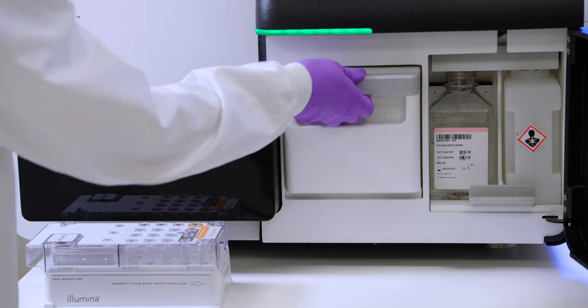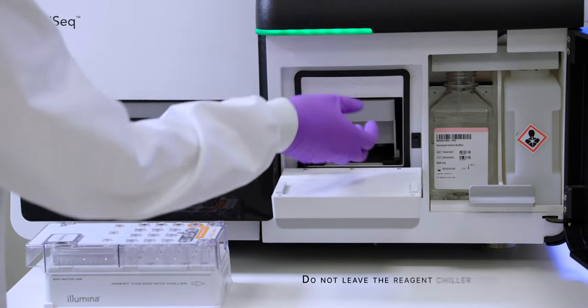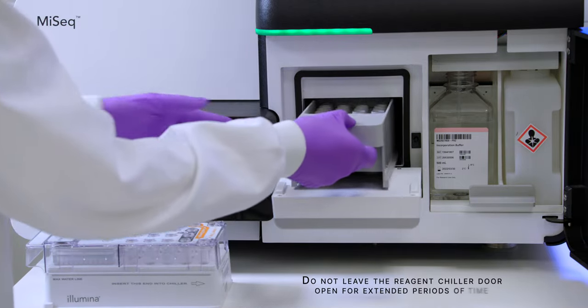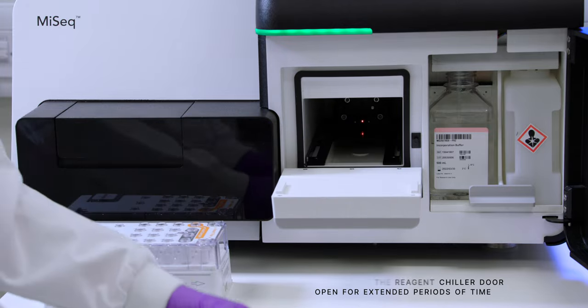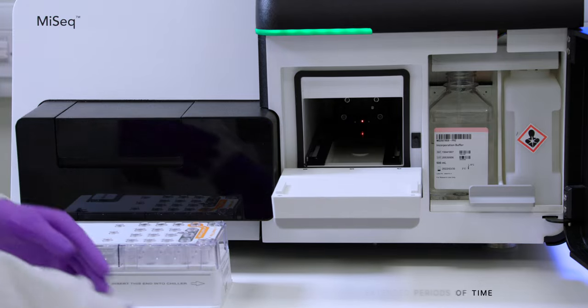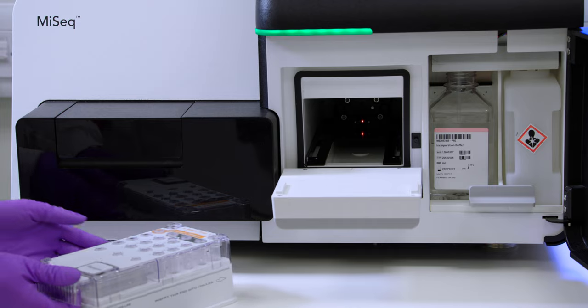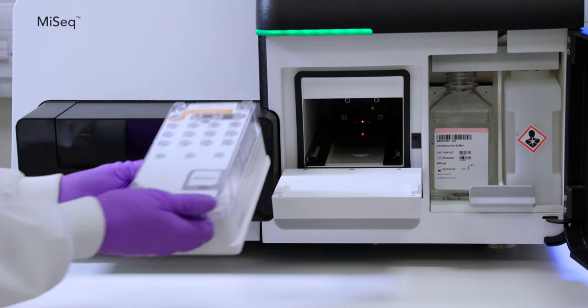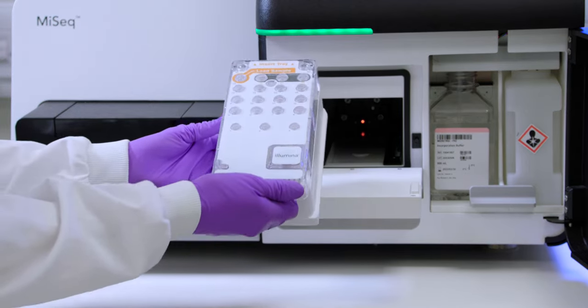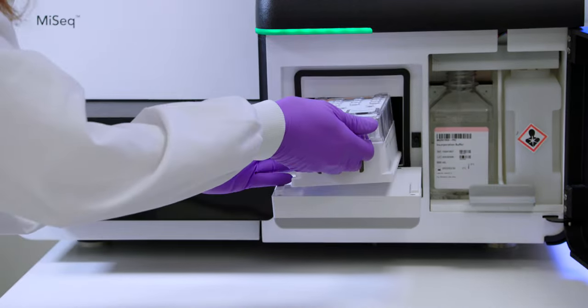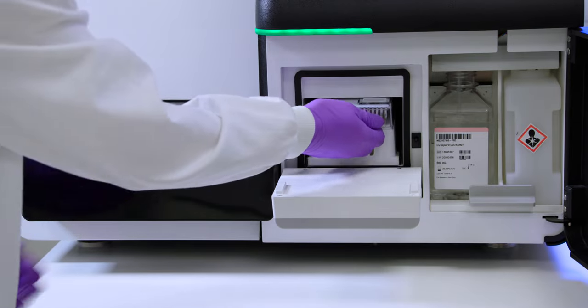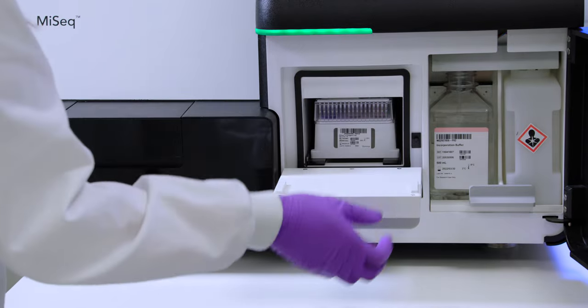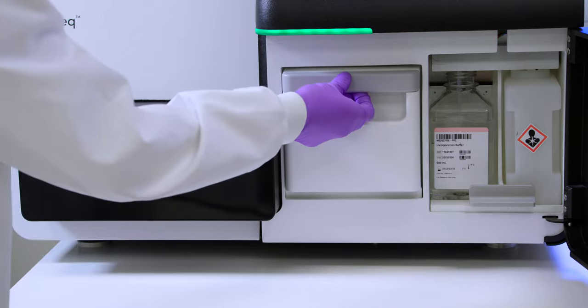Open the reagent chiller door. Hold the reagent cartridge from the end with the Illumina label and slide the reagent cartridge into the reagent chiller until the cartridge stops. Close the reagent chiller door.